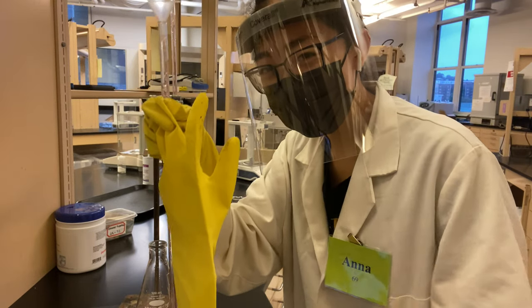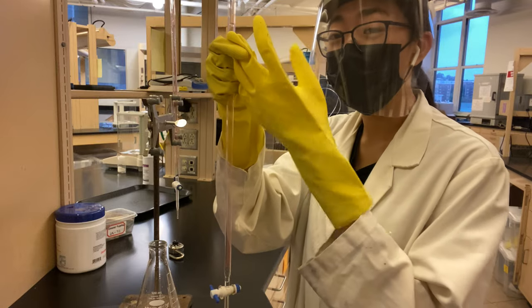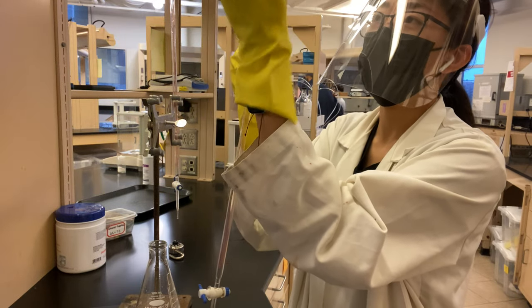Okay, hello, this is Anna Lee, and this is the digital badge for the burette — the 25 mL burette.